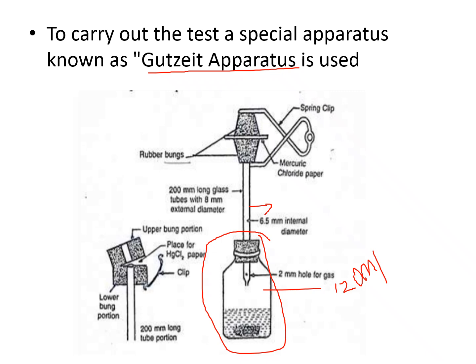The tube has an internal diameter of 6.5 mm and a length of 200 mm.